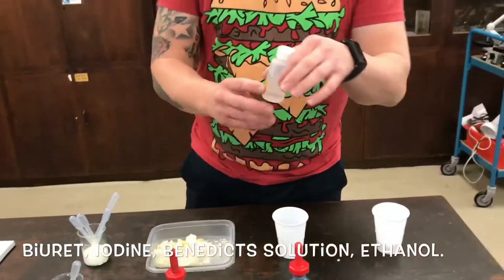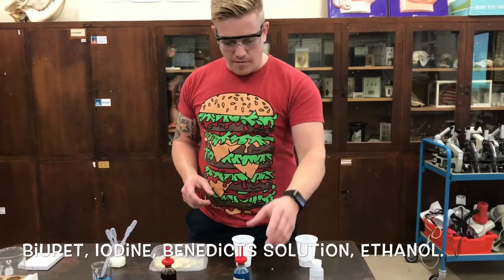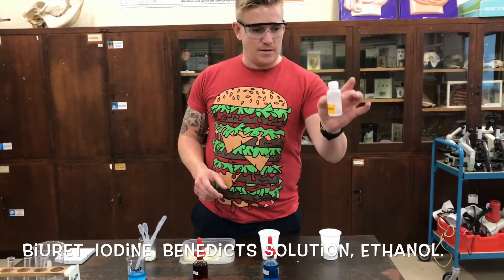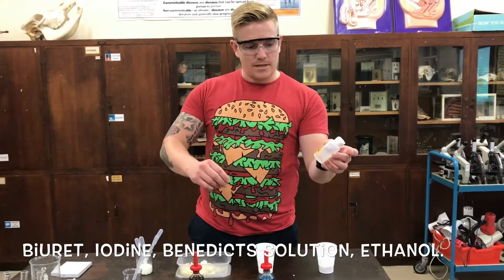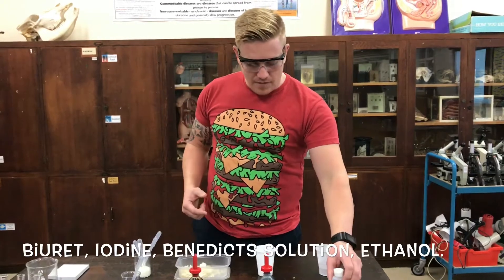We'll be using ethanol. Ethanol tests for fat. We mix it with water and it finds out if there is any fat. The way we find that out is the ethanol and water mix creates a white residue, and we'll see that if there's any fat.